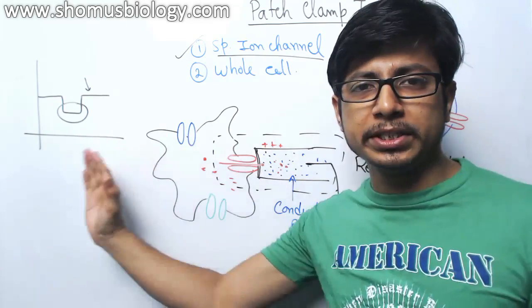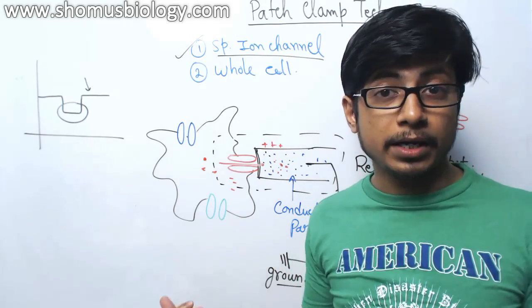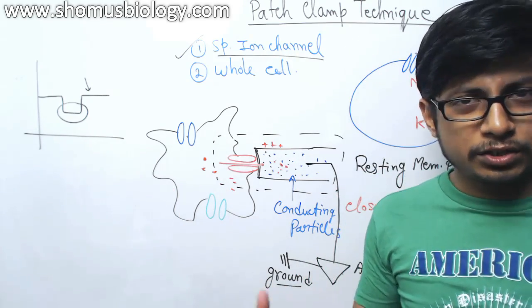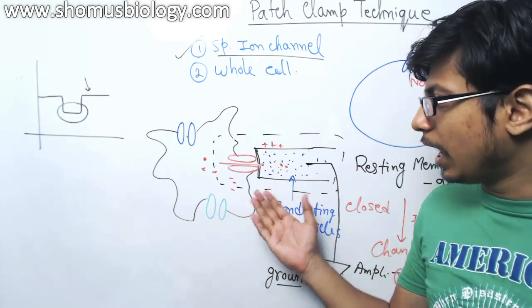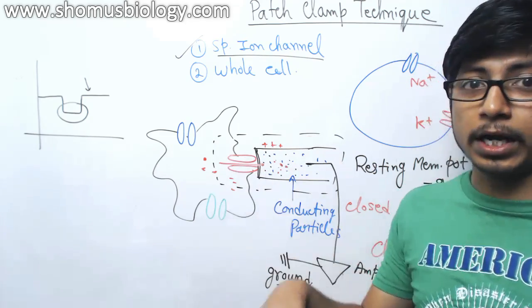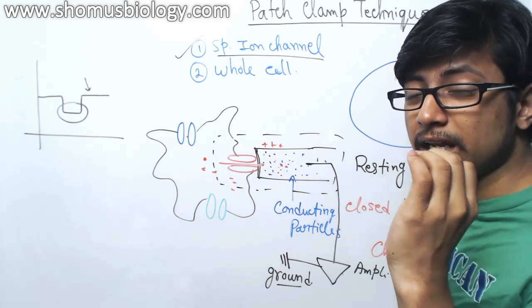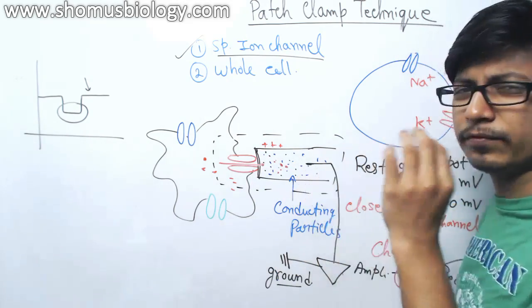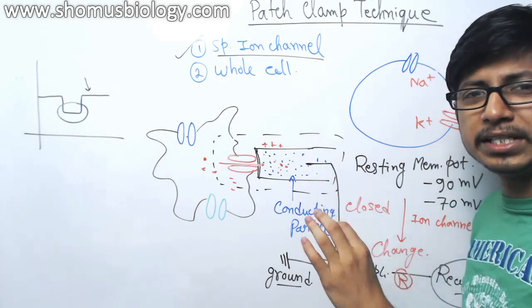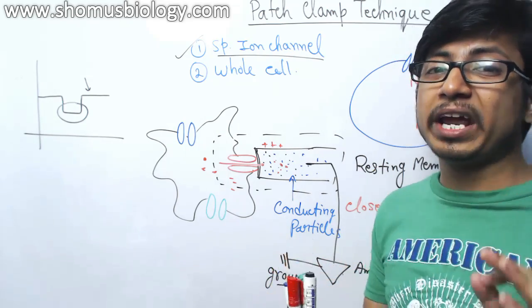So all the setup and machinery that we need is very sophisticated, and this is not only a job for a biologist. The person who handles this must know all those instruments and structures, how electric current works, how voltage works, how to measure them, and how to find out the graph. And this is also delicate because the pipette is interacting with a cell, and you know how tiny it is. The diameter of the pipette is very small, in the 1.5 to 5 micrometer range, and that will be very difficult without a properly trained eye.